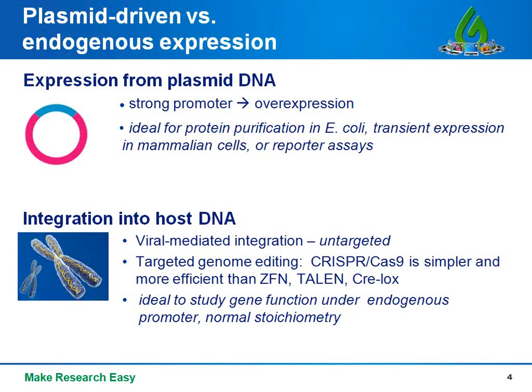However, in some cases, you may want to integrate your expression cassette into the host DNA. Using viral vectors can be easy and highly efficient, but viral-mediated gene transfer is not targeted. That means that genomic integration may occur anywhere in the genome, so there's some chance you may be disrupting some endogenous gene or regulatory region.